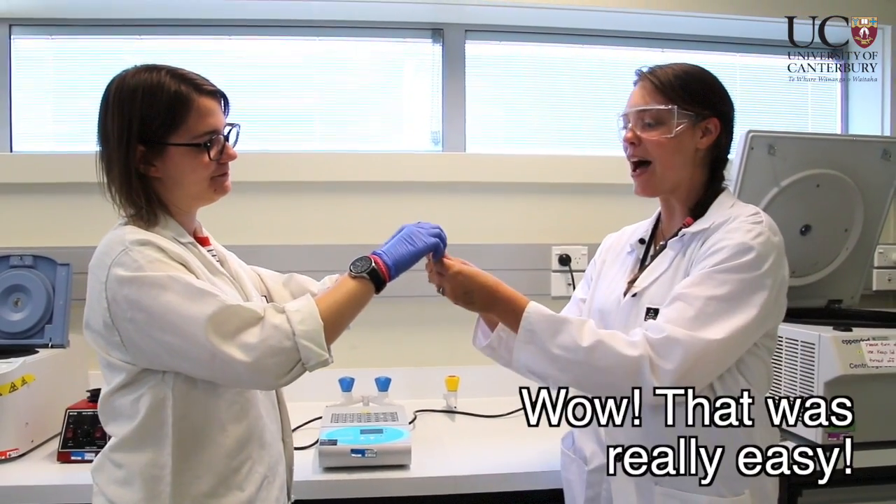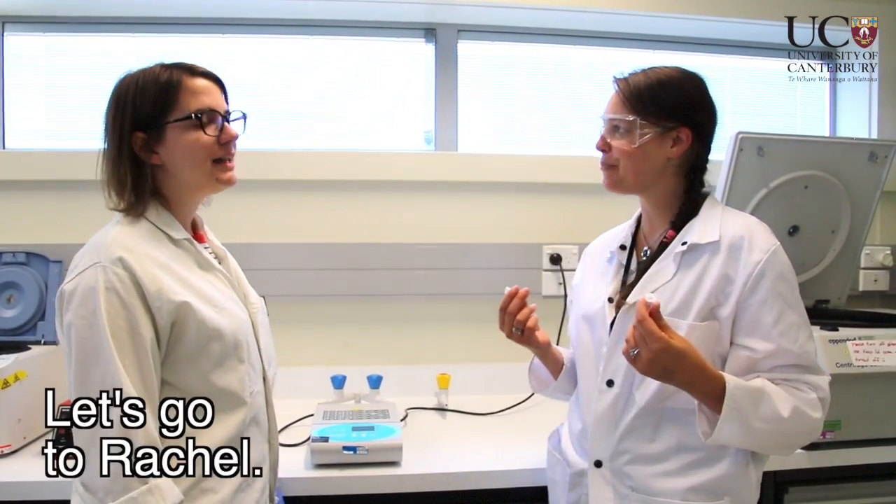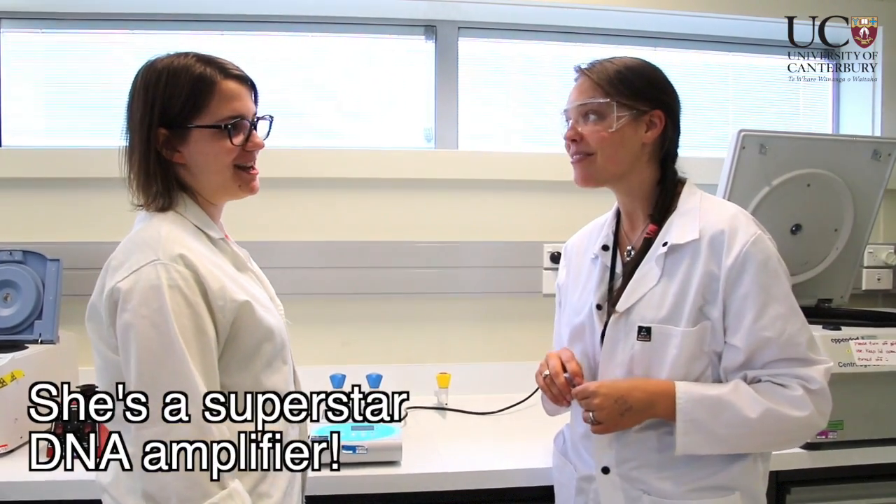Here we go, all ready. Wow, that was really easy. Awesome. So what's the next step? Let's go to Rachel. She's a superstar DNA amplifier.